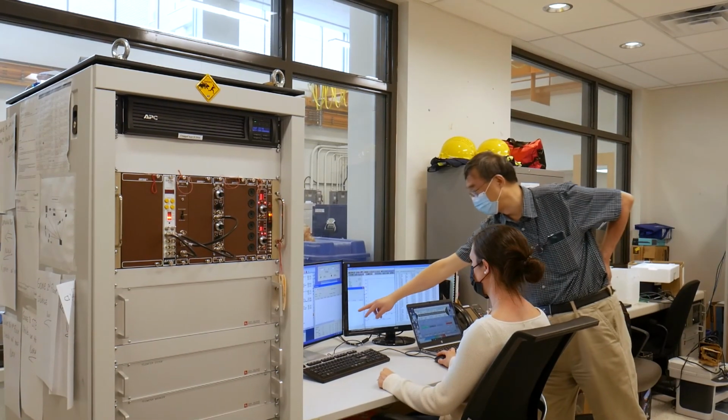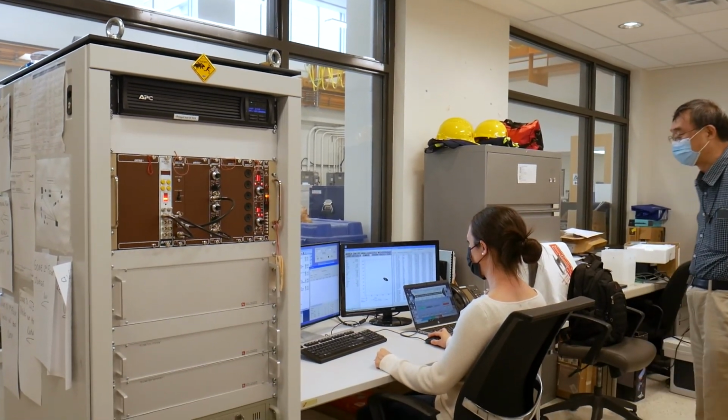One of the other foundations of the lab is training the next generation of scientists. So on campus, we invite students from earth science classes or other backgrounds in science to come into the lab and either take tours or process samples, learn a little bit more about what we do in the lab, the physics side as well. We have students from physics. And we also have a training program for archaeologists and other researchers that use the facilities here. And they can come to the lab and process their own samples with hands-on training from one of our specialists here in the lab. And so we have a slogan: our doors are always open.